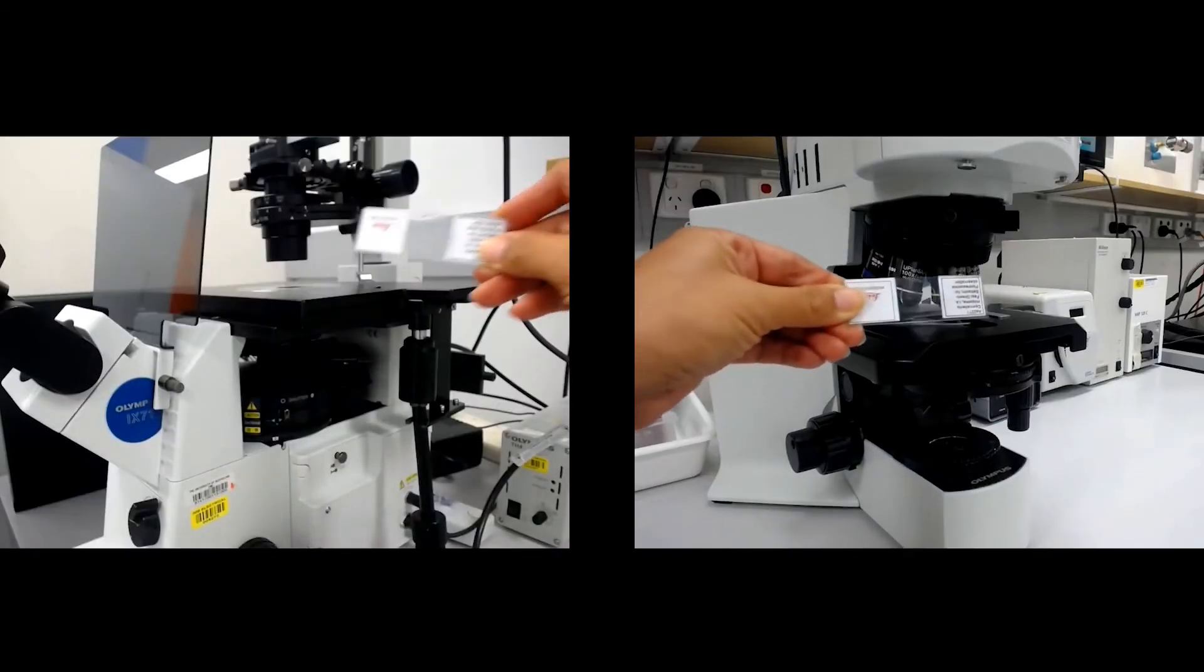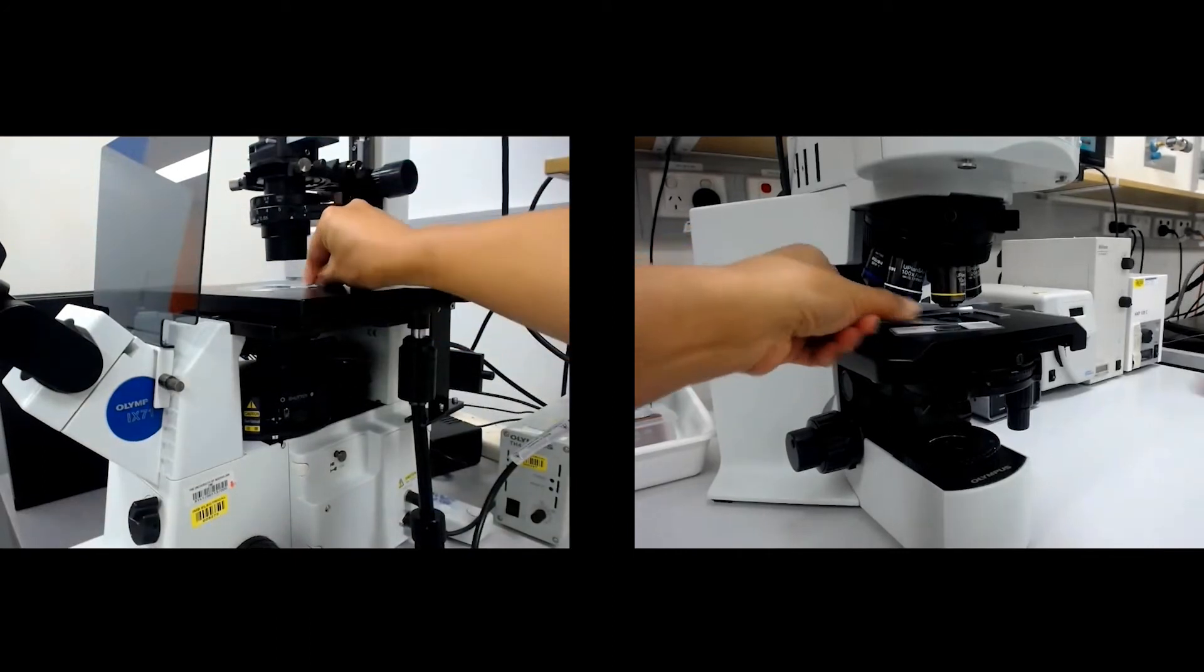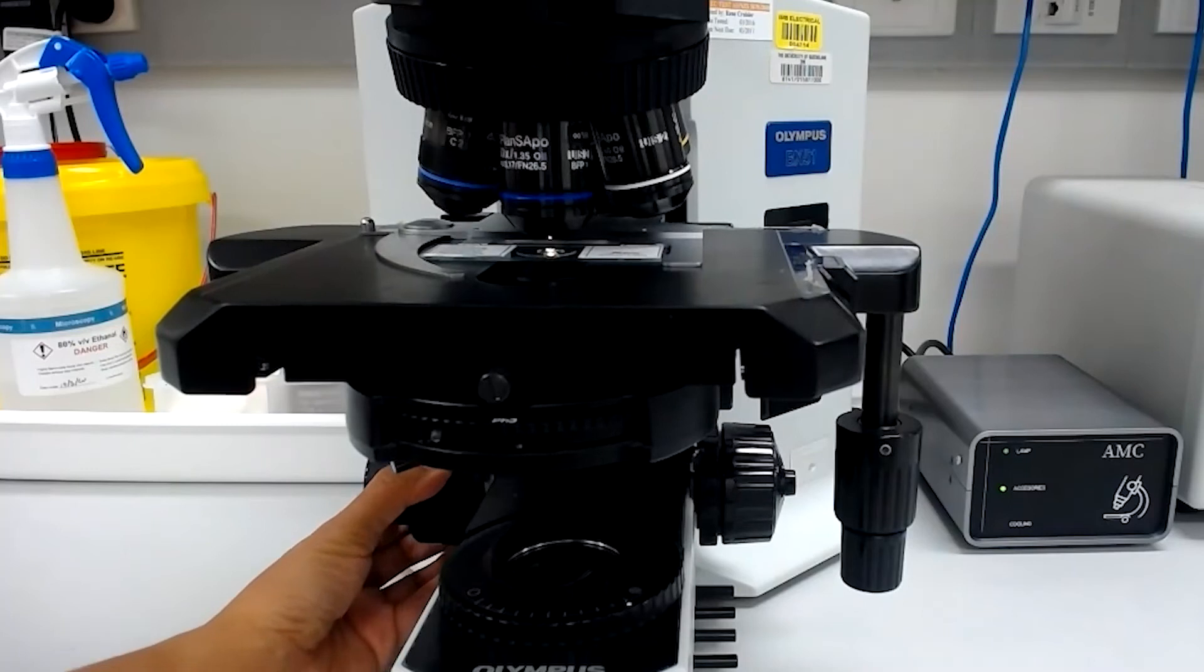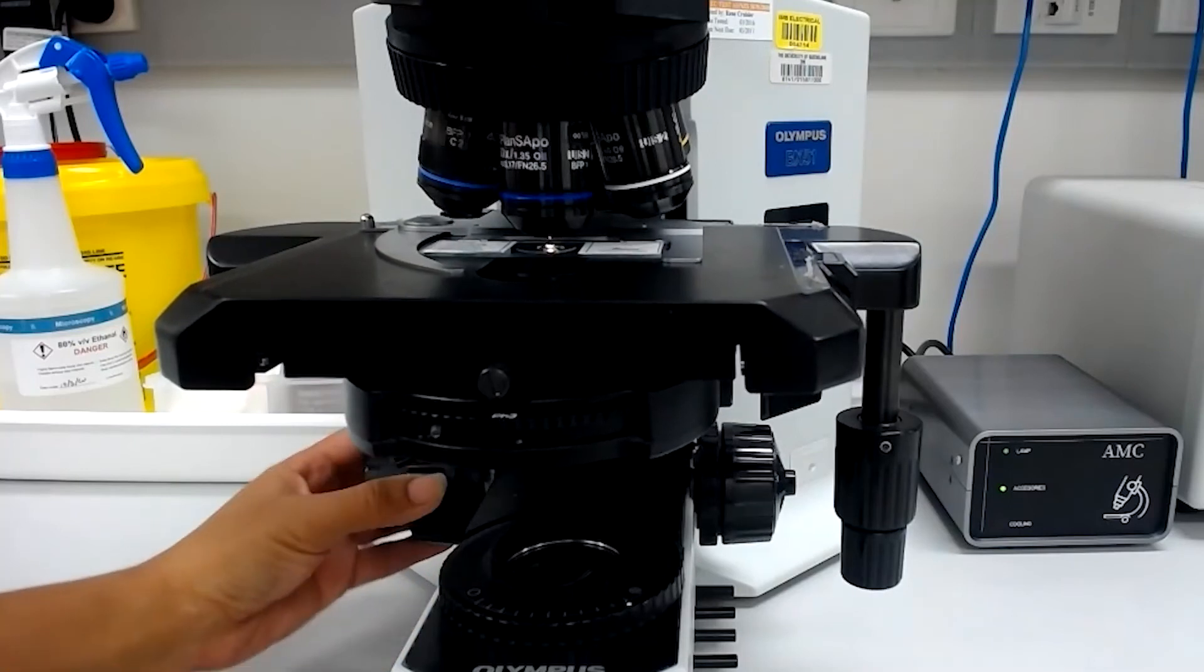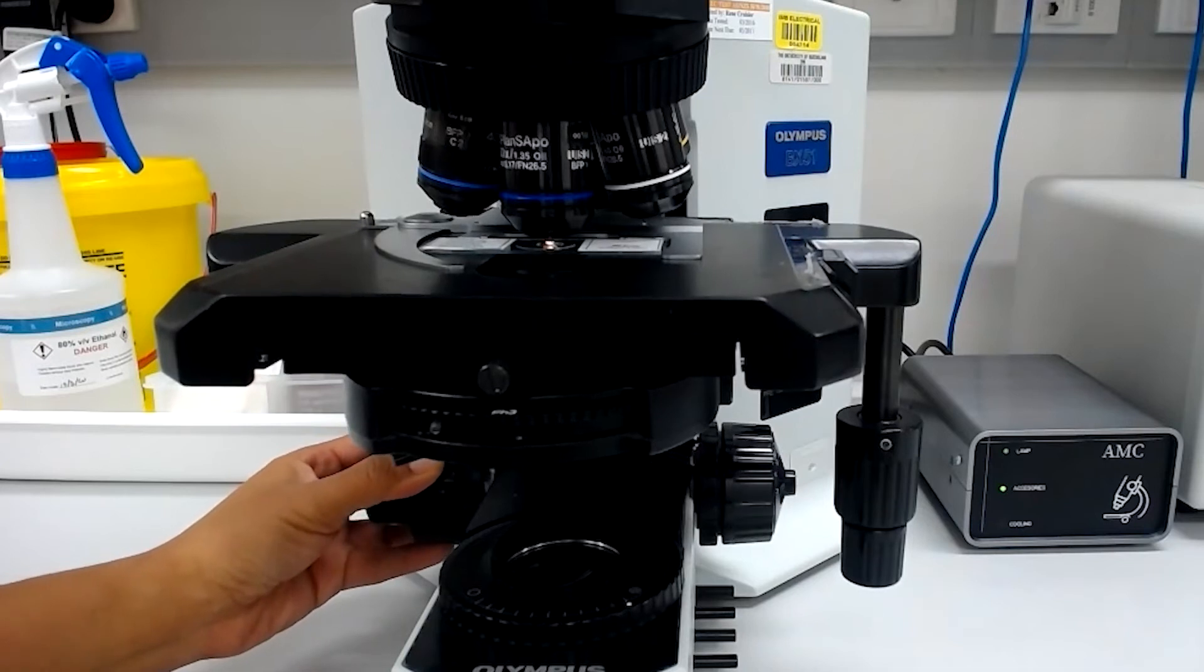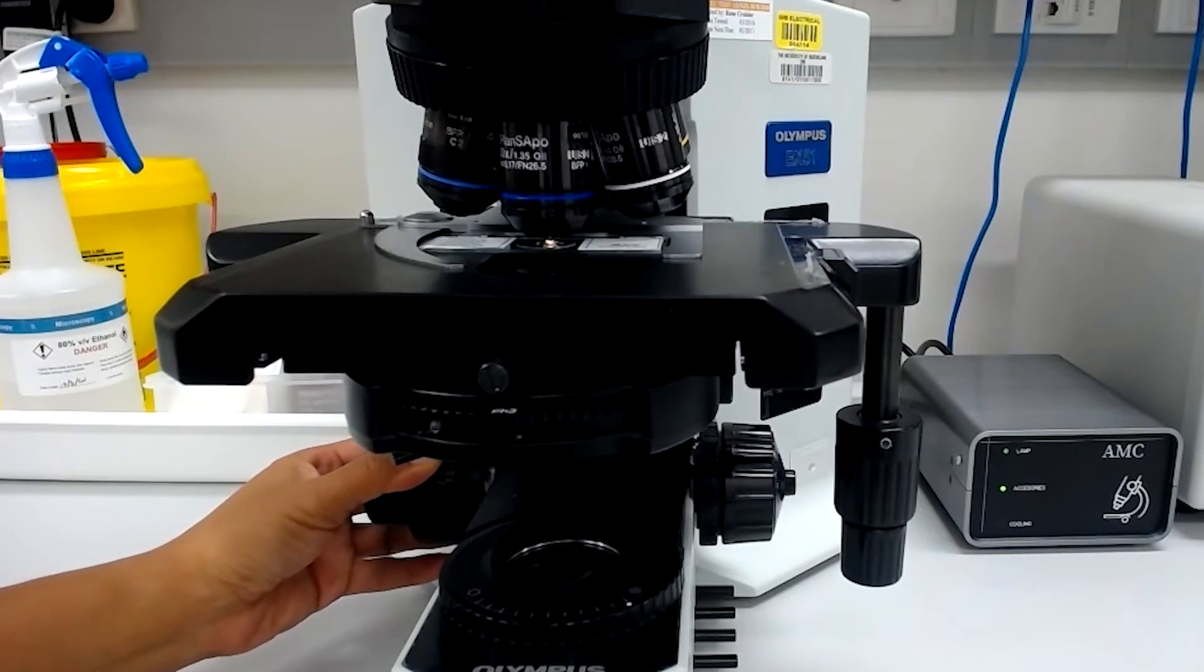Place the slide on the microscope with the cover slip pointing towards the objective. Move the Z position knob to bring the objective closer to the sample. There should be an increase in light as the sample becomes in focus.